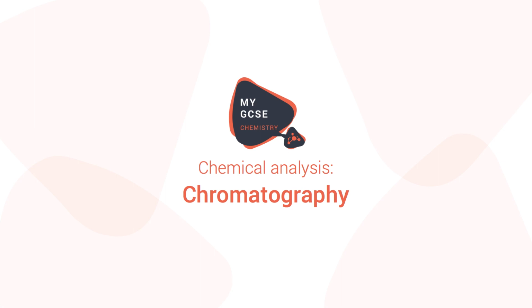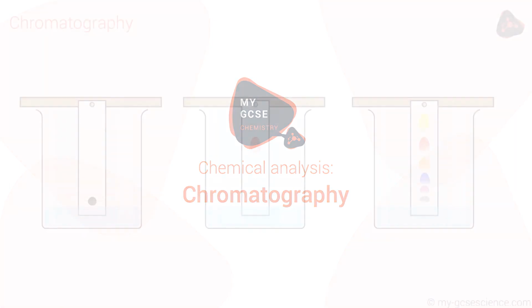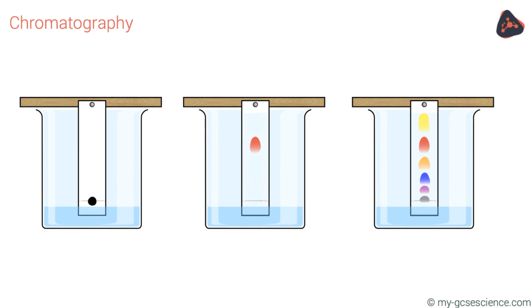This video is about chemical analysis and specifically chromatography. Now we did look at chromatography early on in separating mixtures, but in this video we're going to look at it in a bit more detail, look at calculating RF values as well as how we would go about doing required practical 6. So first of all, just a bit of a recap.